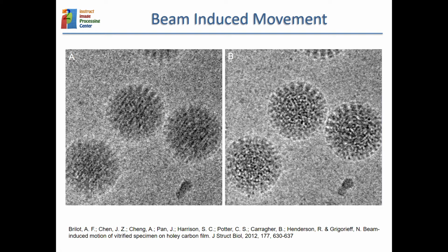While if you fractionate this 1 second exposure into millisecond exposures, then each one of the millisecond frames will have much less signal to noise ratio, much less contrast, but by aligning the frames you will be able to correctly register those frames into something that doesn't blur the information content.